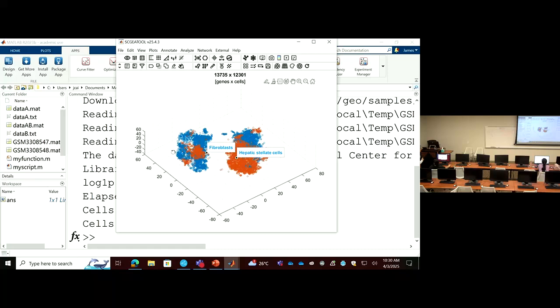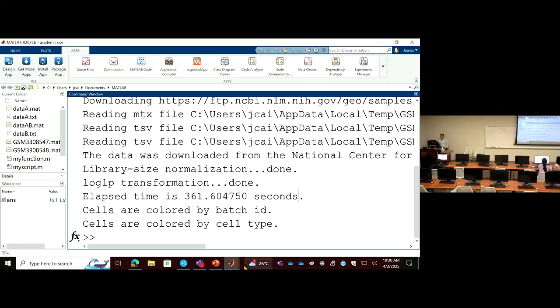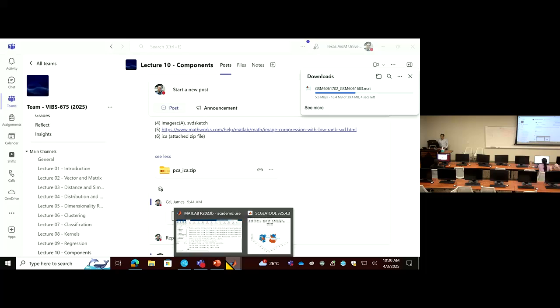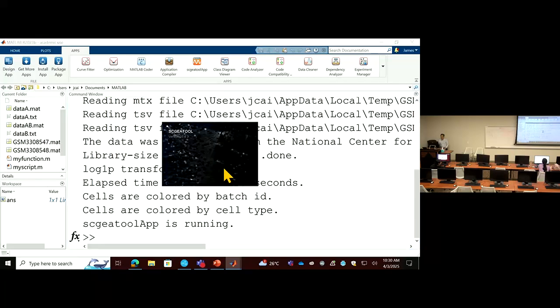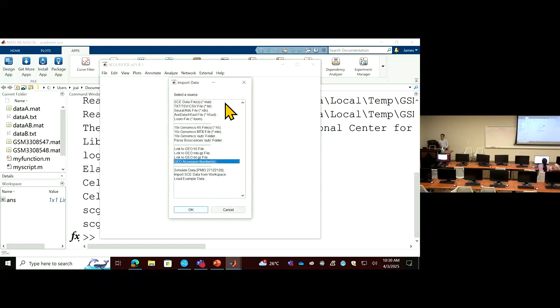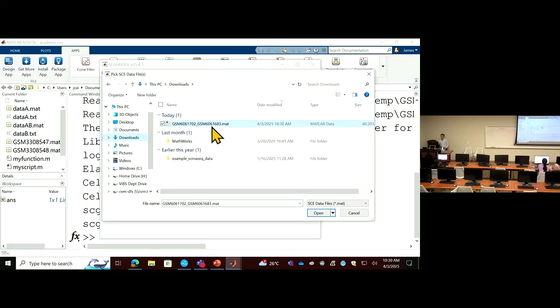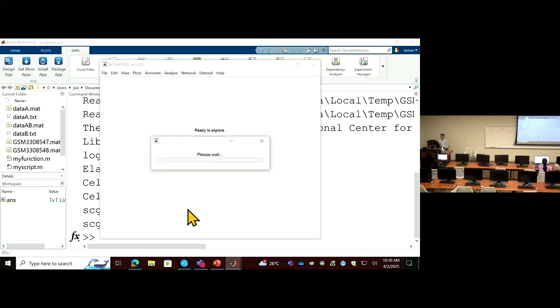Let me load this example in there. So this is case study number 2. I'm going to load case study number 3 as I prepared here. So I download this and open another, and load that example in here so we can make a quick decision on which cell type we are going to use.